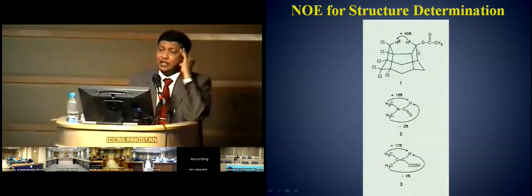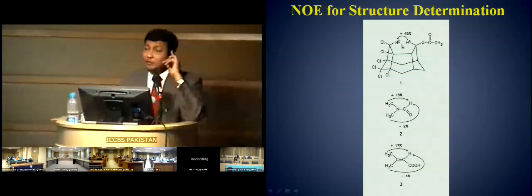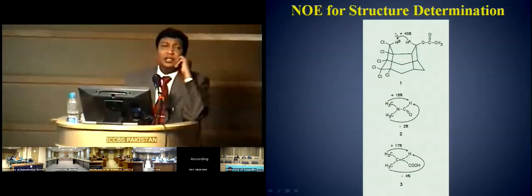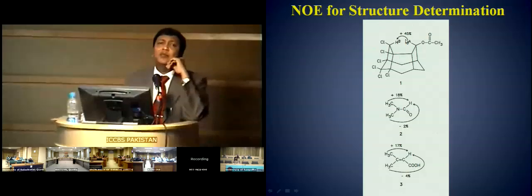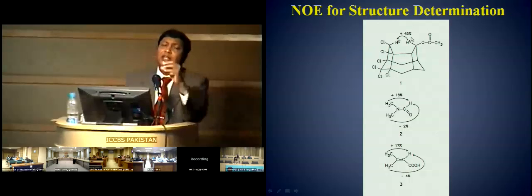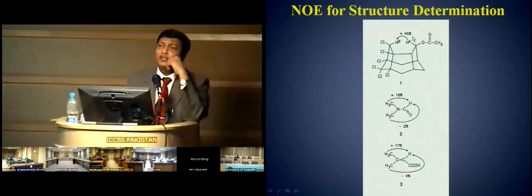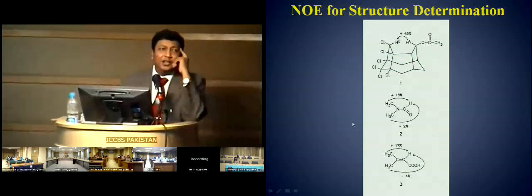HA has lots of different partners, and it can transfer this energy to them too. While HB has no partner which can accept the energy except HA. So the reciprocal NOE is very rare. I think if somebody can generate a reciprocal NOE, it primarily means that he has a symmetrical molecule. And if he has a symmetrical molecule, there would be no NOE anyway.